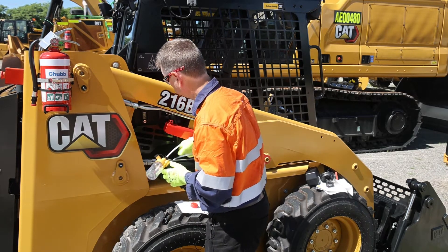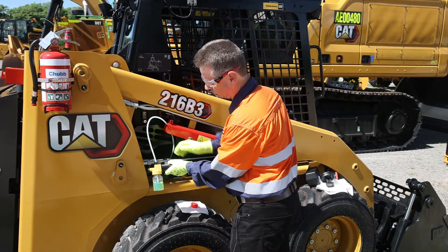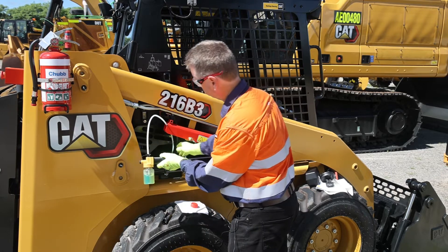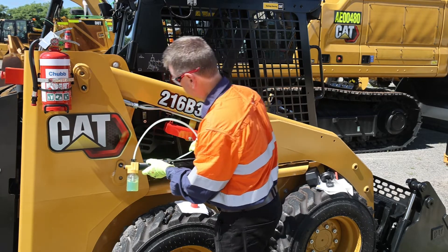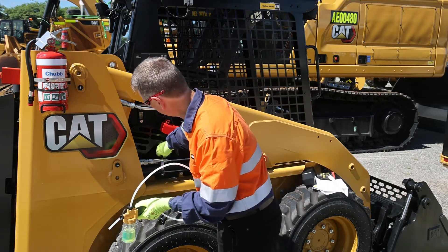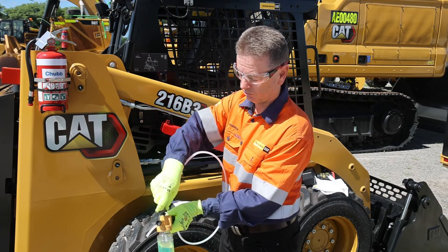We hit the diesel and start pulling our sample — just siphon it up until we roughly get into this area just here, which is the correct sample level. Once you've got it in there, pull your tubing out so the vacuum stops. Replace the lid straight away and remove the tubing.